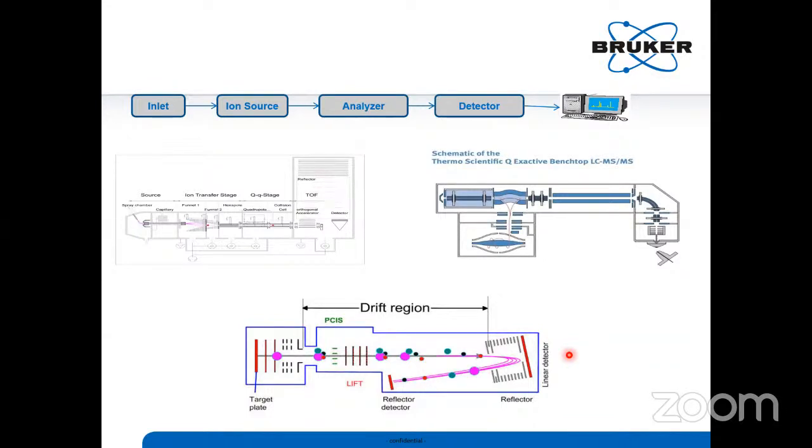That's why in all central facilities, if they have QTOF, triple quad, that is different, but every central facility will have one MALDI TOF technology. Because if you use any HRMS technologies like LCMS, QTOF, Orbitrap, you may have some limitations, like you can't do polymer analysis. Why? Because it will carry different contaminations. It may contaminate your tubings, everything.